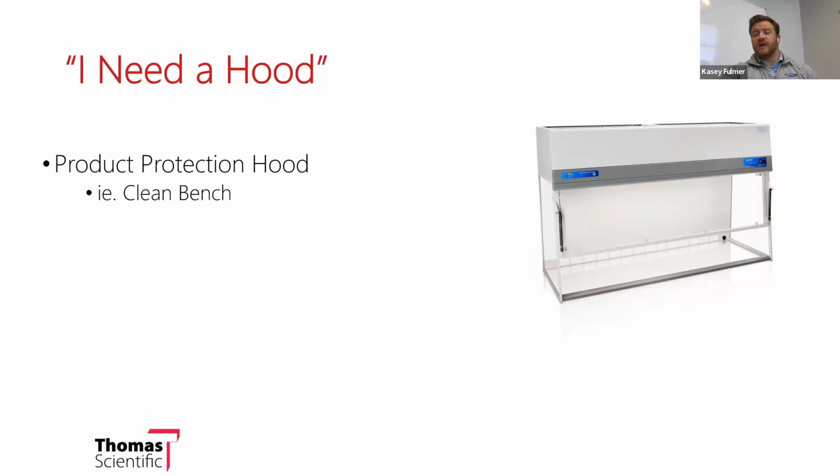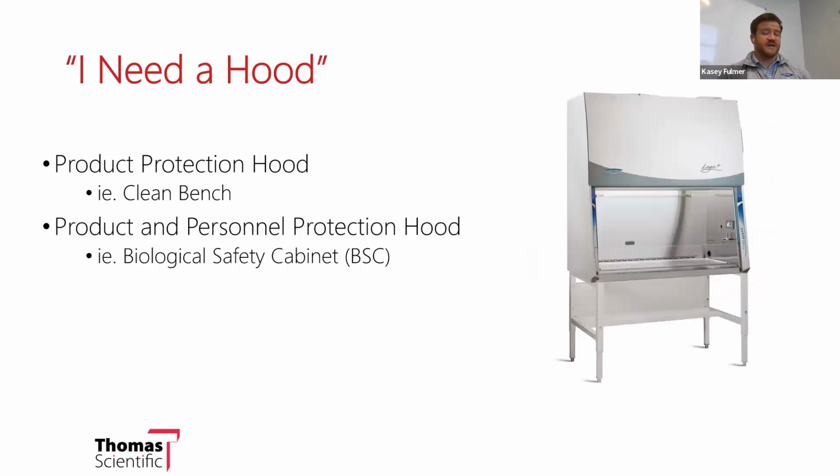We know that people who work in biological safety cabinets, or BSCs, call those hoods. And these are different because they offer both personnel and product protection. So if you need a product to remain in a clean environment on the interior while also having an inflow of air to protect the user, then a biosafety cabinet is what you would need.